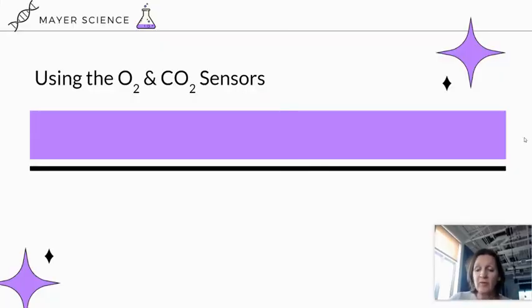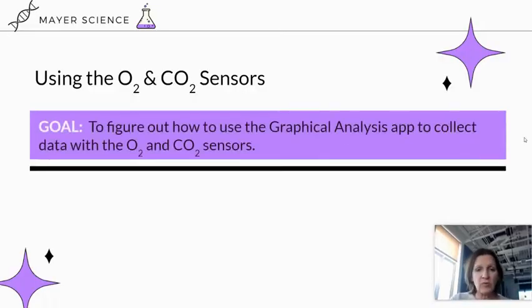The goal of this video is to show you how to use our graphical analysis app to collect data with the oxygen and carbon dioxide sensors. So these are the gas sensors that you're going to be using.